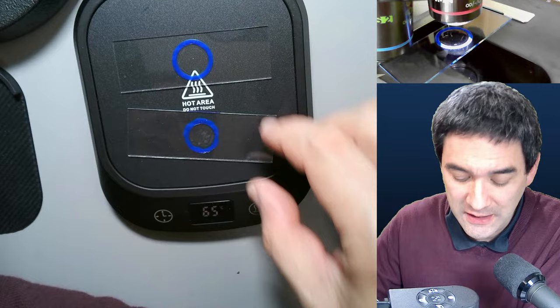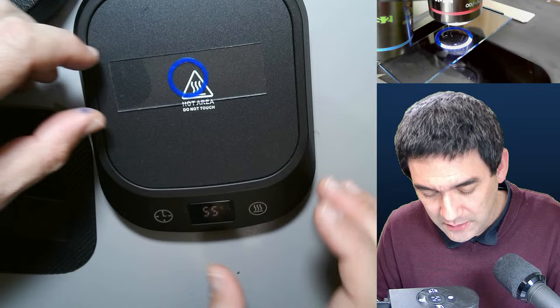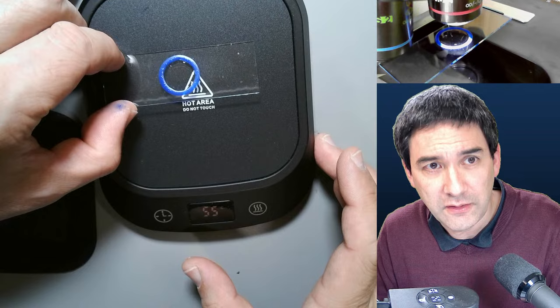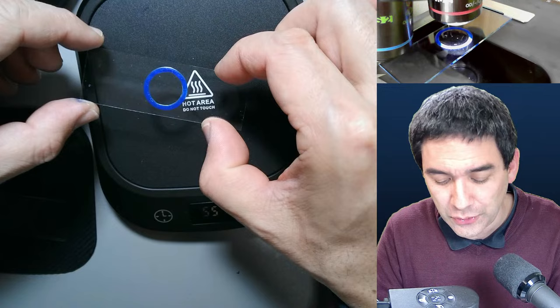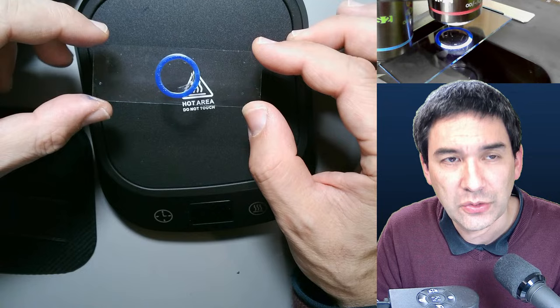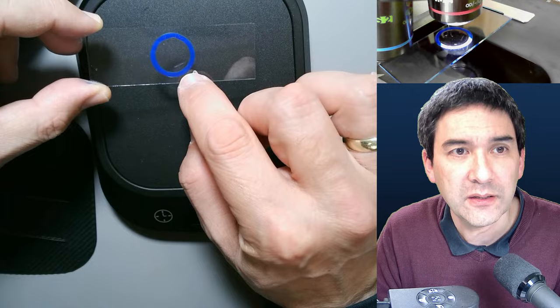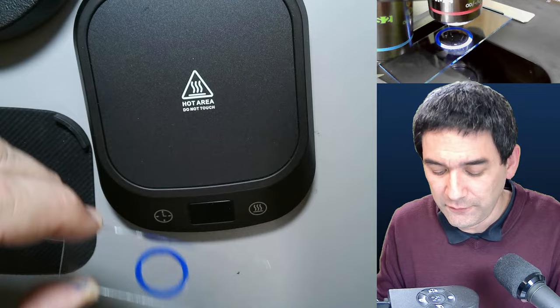I'm going to cool it down and put it under the microscope. Here we are — this is the spot where I touched it. If we wait a little bit, these vitamin C crystals should start to grow. And now here is the urea — also quite nice crystals forming here. I've got some polarization on, so it looks a little bit like modern art. It's a really quick way of growing crystals using the coffee warmer.